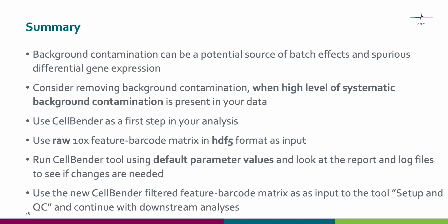To summarize what we have learned: clustering is a fairly robust method to CellBender background removal. However, especially when a high level of contamination is present, it can be a source of batch effects and spurious differential gene expression. Consider removing background contamination when a high level of contamination is present in your data. Use CellBender as a first step in your analysis and use a raw 10x feature barcode matrix in HDF5 format as input. Run CellBender using defaults first and look at the report and log files to see if changes to the parameter values are needed. Use the new CellBender filtered feature barcode matrix as input to the Setup and QC tool and continue with downstream analyses including filtering, dimensionality reduction, and so on.